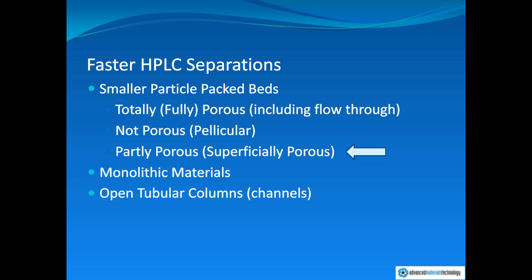We have totally or fully porous particles, and in my talk you may see this as an FPP, that stands for fully porous particle. These can flow through the particle as well as undertake rather tortuous paths of diffusion through the particle itself.